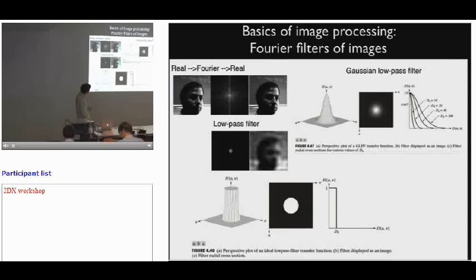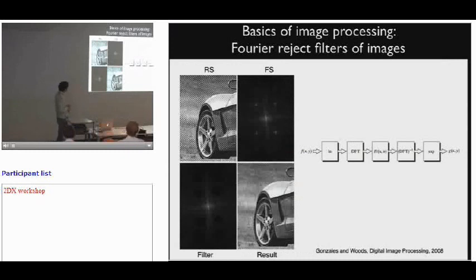However, there are other ones that are not so straightforward to express in a mathematical equation, and this is what you would also do in 2D crystallography. So this is one image that was plotted in the newspaper, and you can still see kind of a pattern from the plotter that is there. If you take a Fourier transform of that image, you get a continuous transform of the car wheel in the background. However, you do get spots originating from this plotter pattern. So what you can do is apply a reject filter, and this is also not very well displayed. You can actually mask out these certain spots, and what you get out of this is actually the car pretty much with the pattern removed.